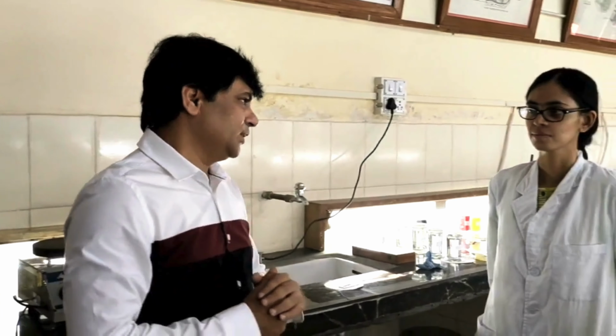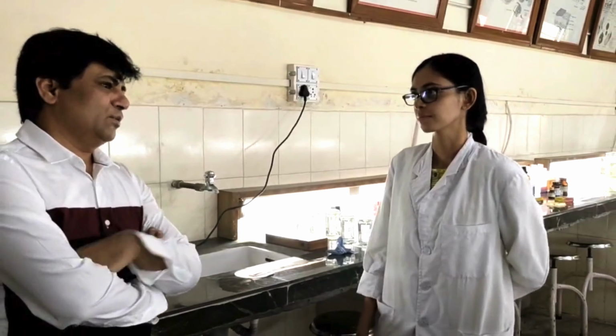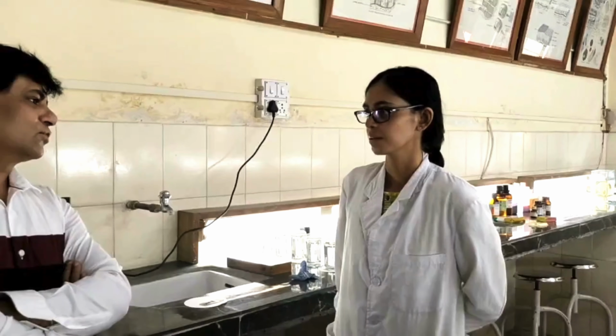You know, guys, there's this commonly asked question in your histology exams. Many students generally get confused with this: what is the magnification of a microscope and what is the resolving power of a microscope? So this is a question to Swami. Swami, tell me what is magnification of a microscope and what's the difference between it and the resolution of a microscope?